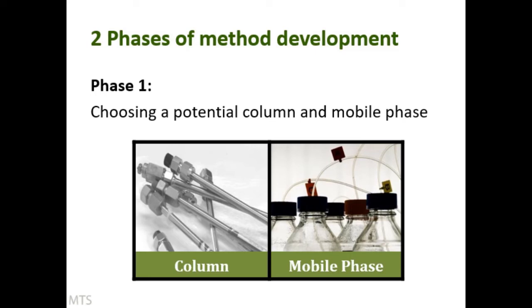Now you do have the option to change that mobile phase, to change the proportions, so you do have a lot more, but you need to put something on. So that's what I would refer to here as this phase 1.